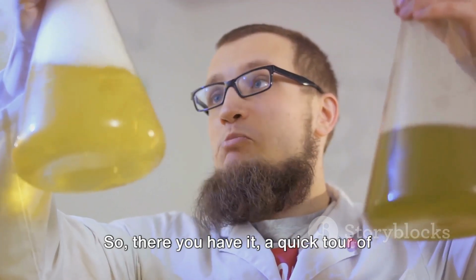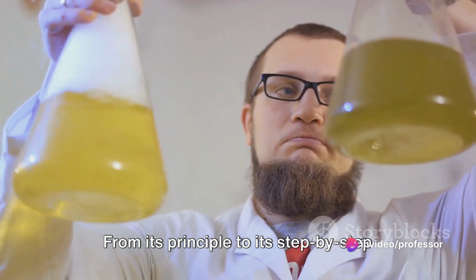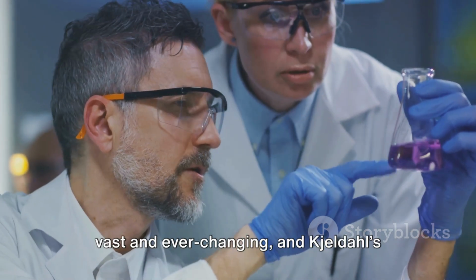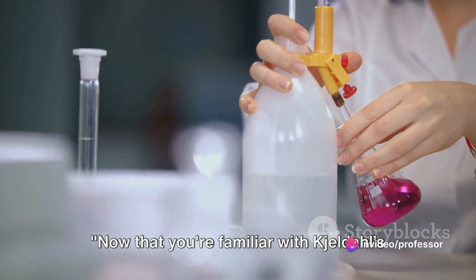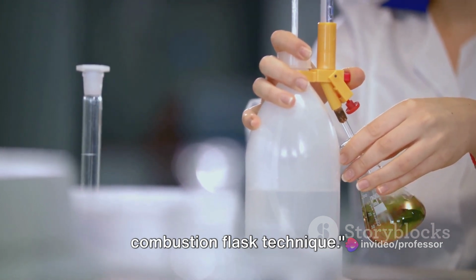So there you have it, a quick tour of Kjeldahl's method. From its principle to its step-by-step process, we have covered the basics of this important technique. But remember, the world of chemistry is vast and ever-changing. And Kjeldahl's method is just one piece of the puzzle. Now that you're familiar with Kjeldahl's method, let's explore the oxygen combustion flask technique.